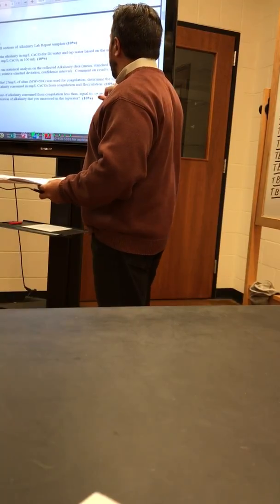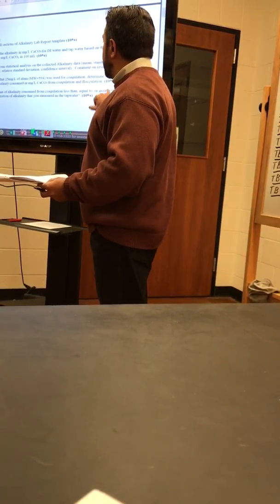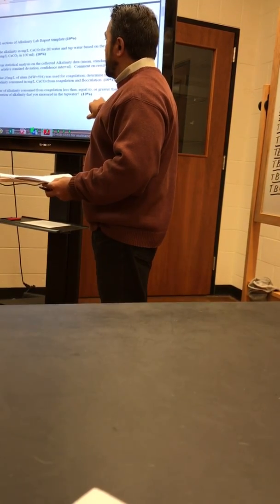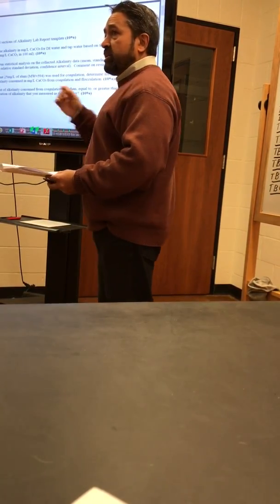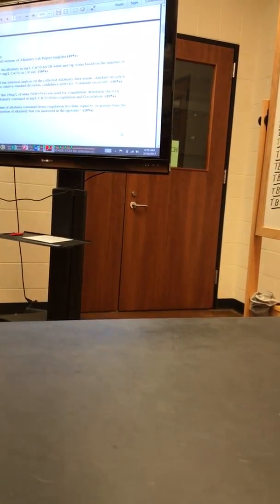Whatever you can think about it best. So that's a pretty straightforward calculation. Then the question asks, whatever you come up with here, is it greater than or less than what you came up with in your titration? Pretty straightforward. So once you get this number, you compare it to that number of alkalinity consumed and see which one is greater. Okay? So those are the 5 pieces. Pretty straightforward, but keep that in mind because I'm going to grade for these pieces.